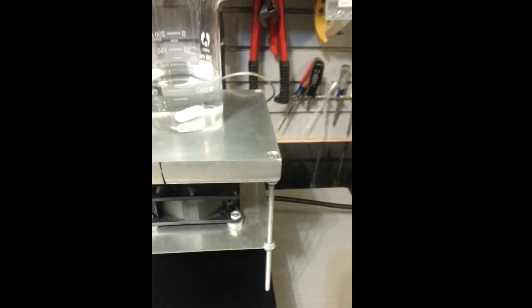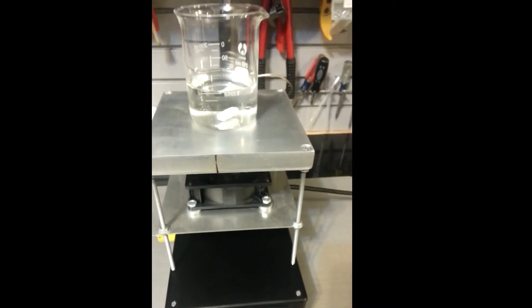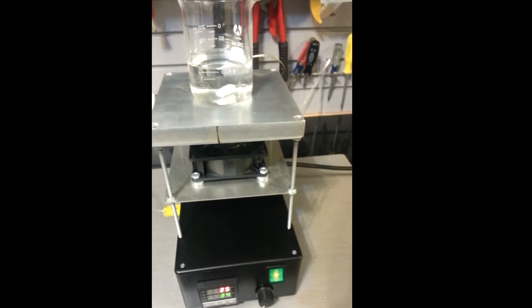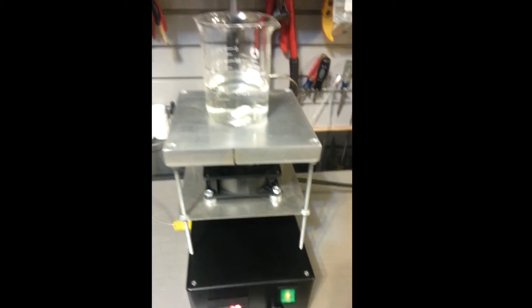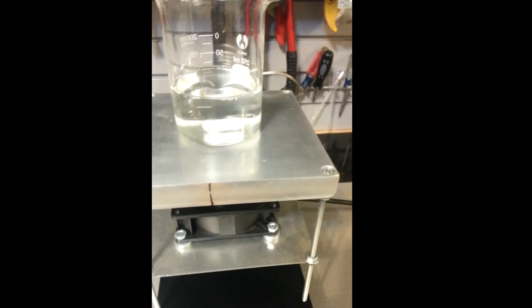And here's the magnetic stirrer. I machined a part on my metal lathe — kind of a heat sink to keep the heat a little more dissipated from the magnet. I used a pulse width modulator circuit that I just ordered off eBay for about $5. I was going to build my own, but honestly you can't beat how compact the cheap units are from China now. And it can control everything down to a pretty low speed, which is pretty nice.